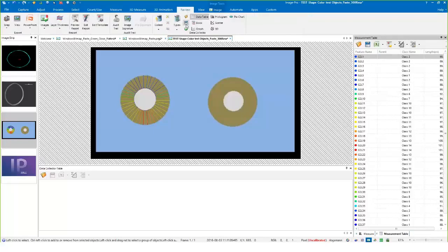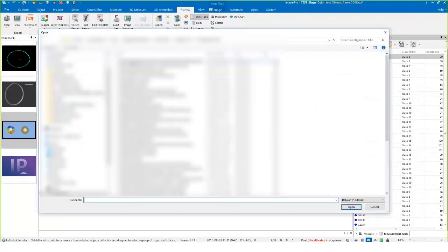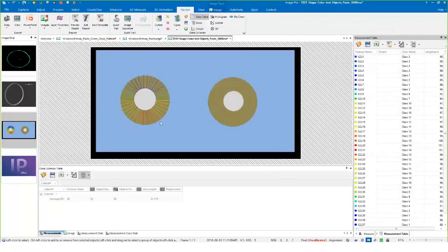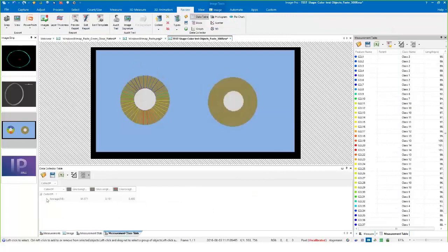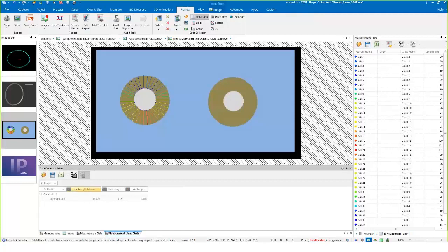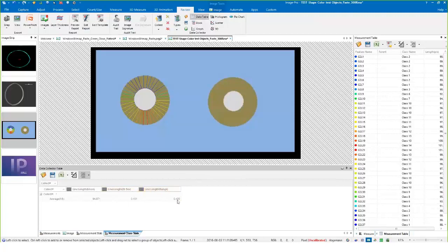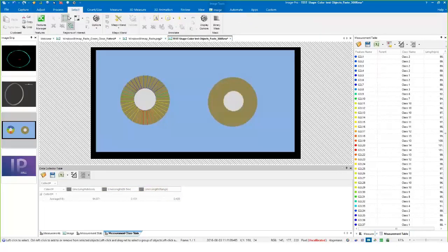I also created a data collector setting here. If I collect into my data collector, what I can see now is a one-line summary of my first collection. I'm looking at three pieces of data: the mean value, the standard deviation, and the range value for this measurement.